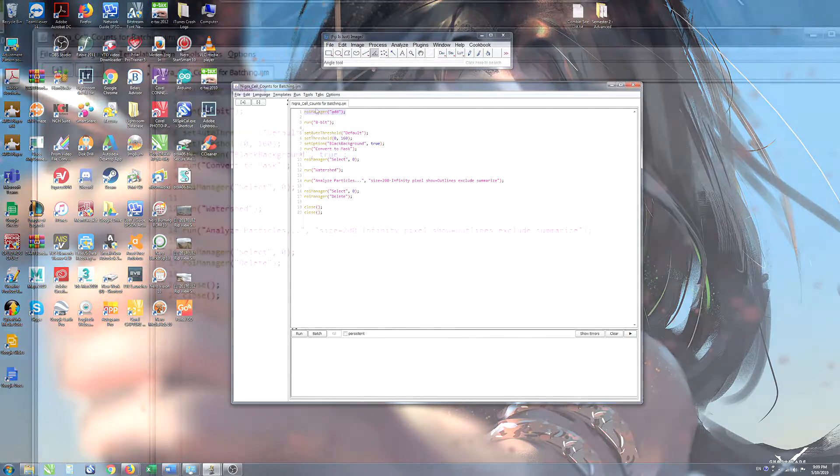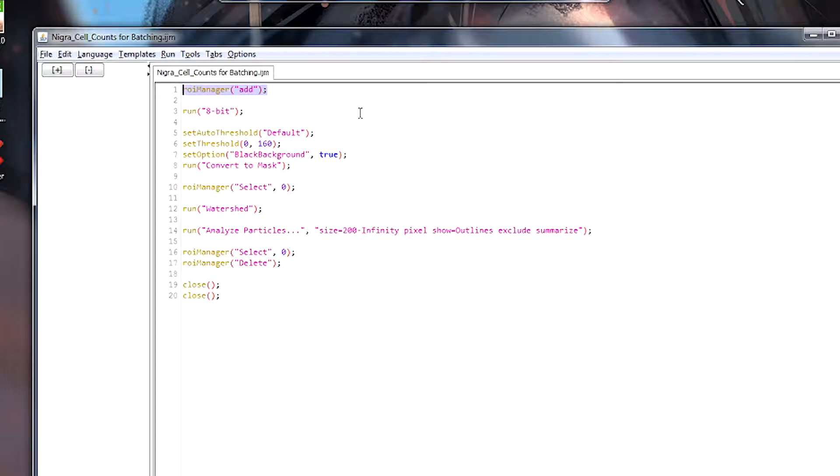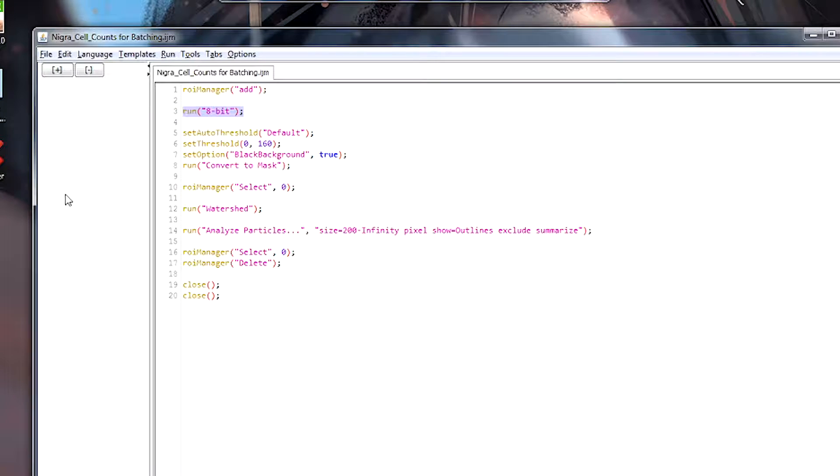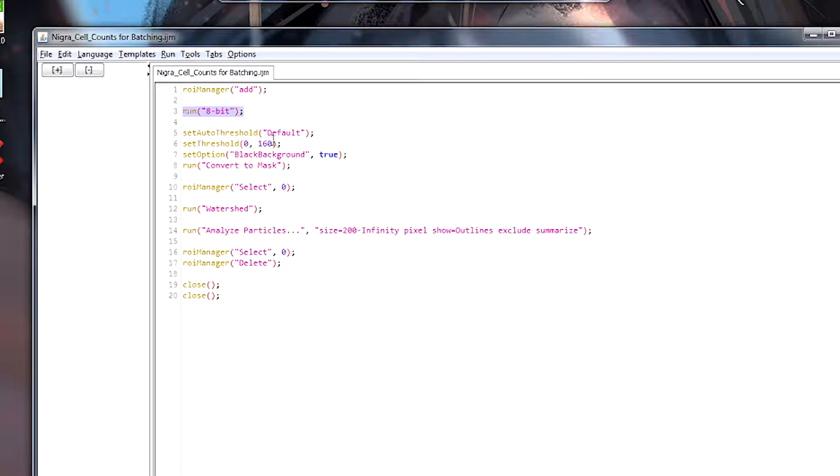First of all, the region of interest is added to the region of interest manager. So that's what this first step is. Next, we convert the whole image into 8-bit which is just grayscale. So that goes from 0, which is black, up to 255, which is white. There's 255 different steps in a grayscale image.